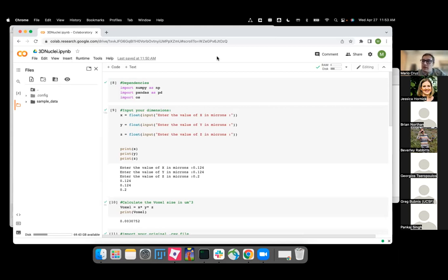We are just thinking maybe Beth can bring us a little more. I'm just seeing that Beth's not here anymore, but yes, we are thinking about that. And maybe in a future release of Cell Profiler, we will have this module for sure.